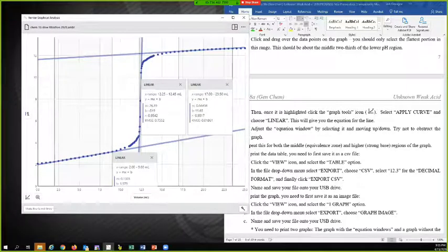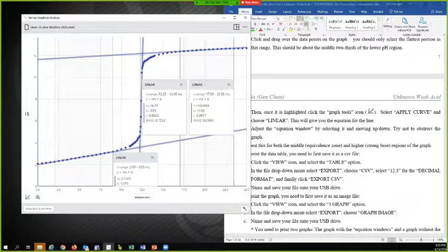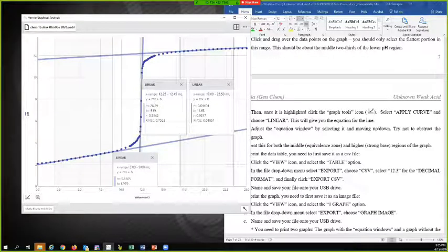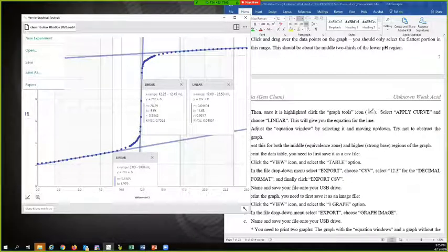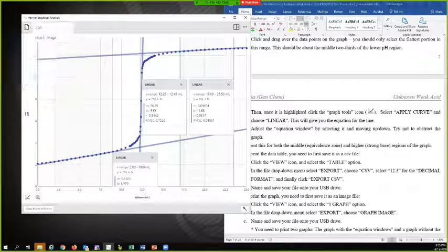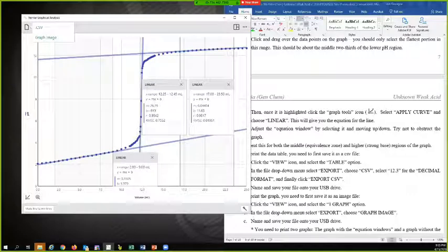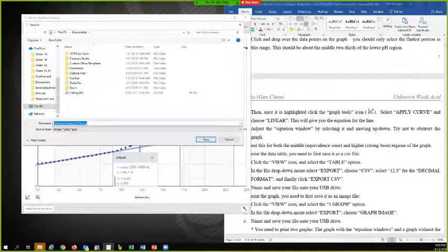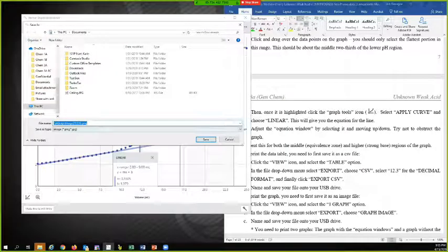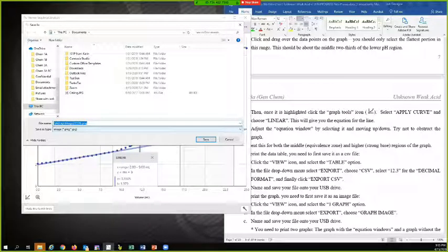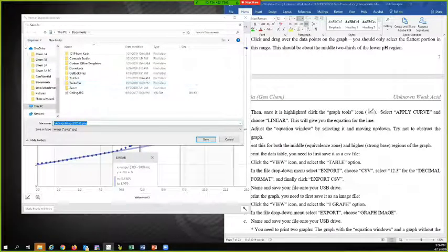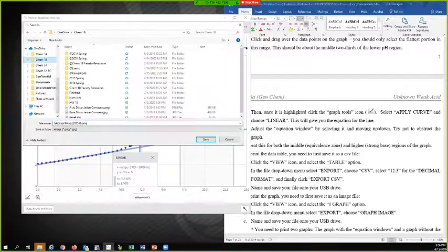And I'm going to choose one graph. And then in the drop down menu, again, I'm going to select export. And this time I want the graph image.